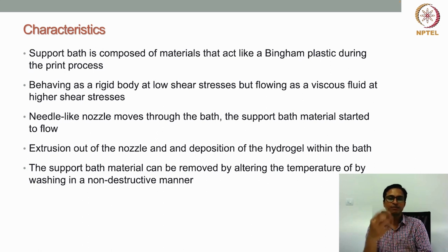Suppose the material is just kept as such, then it will not flow. There will be no flow. The material will behave almost like a solid if no force, or very little force or stress, is applied. But that same material will start to flow when the applied shear stress reaches a certain level. That means at a very low shear rate the material will not flow, but if I increase the shear rate, shear stress or force, then the material will start flowing. That is what a Bingham plastic material is like.